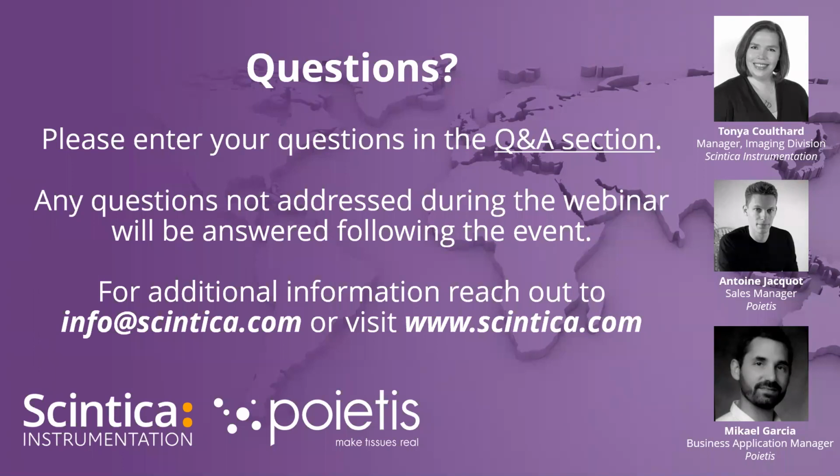And yes, I just wanted to add something. Here we have been printing different kinds of tissues, and for example, regarding skin, we have been printing models a few millimeters in thickness. And regarding the laser, an important thing is that according to the energy that we choose and the concentration of the cells in the ink, we can play on the size of the droplets that we print, and also on the quantity of cells present in these droplets. And again, we can also print materials with the laser. Here we have been controlling the thickness of the layers of collagen using either the laser or the microvalve.